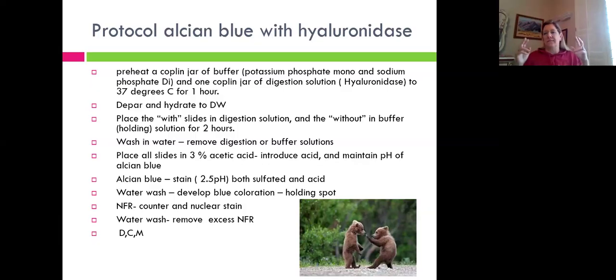And I don't mean dye, pardon the pun. But it's not a do or die type thing if you aren't right there when that timer goes off. The time frames of these things have latitude. You don't have to panic. You don't have to be right there watching the timer tick down.